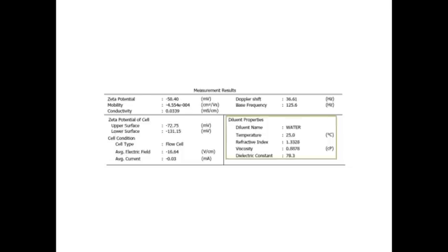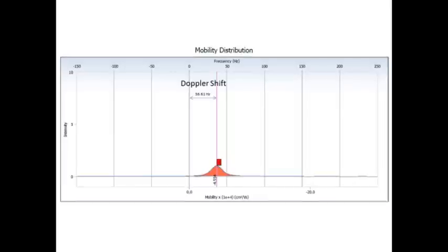Different diluents can affect particle migration or sample consistency, so it is essential to use a diluent best suited for the sample. In this case, distilled water is used. The blue line is the raw data, the red curves indicate the fit, and box 1 indicates a Lorentzian peak.